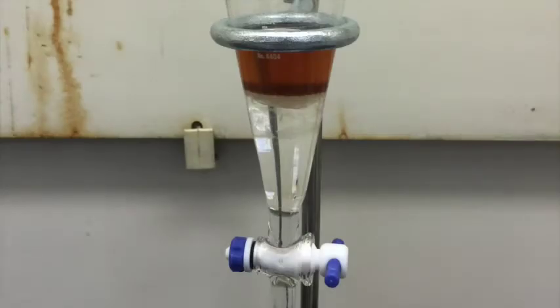So here we have a piece of chocolate that's been ground up in a mortar and pestle with acetic acid. Now, acetic acid you can think of as water. We call it an aqueous layer. Anything like sodium hydroxide, acetic acid, buffer, if it's something dissolved in water, you can think of it as water when you look at that miscibility table, and we will call it the aqueous layer. So if it's water-based, water with something dissolved in it, we will call it the aqueous layer.